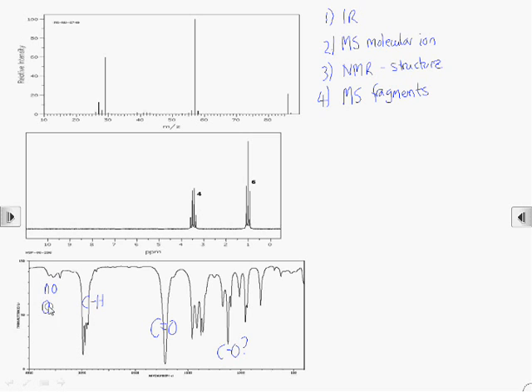Always the carbon to hydrogen stretch is at 3000, but we can see that there's no broad absorption up in the region where we'd expect carboxylic acids or alcohols or phenols to absorb for the oxygen to hydrogen vibration. So this is going to be an aldehyde or a ketone or an ester, and we can rule out carboxylic acids or amides.